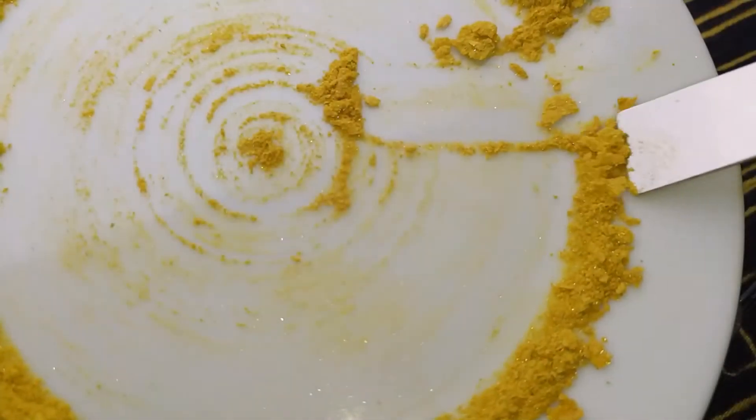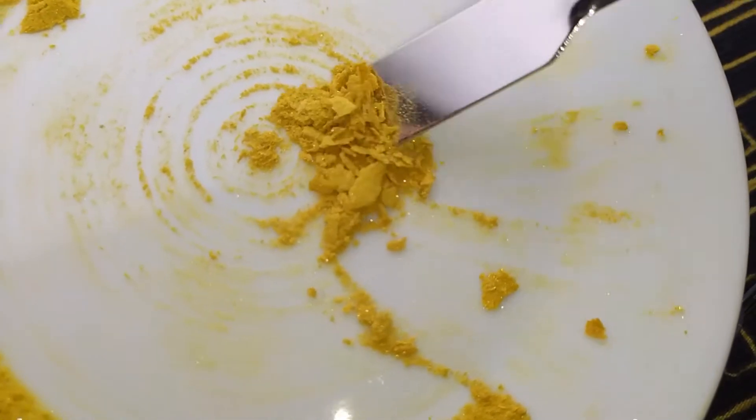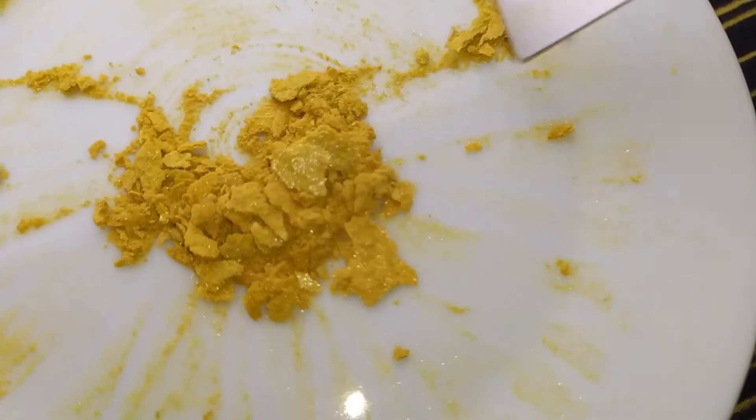Hello everyone. In today's video I want to show you how we can do recrystallization of harmaline alkaloids. Please be advised that this video is strictly for educational purposes and harm reduction, and not an instruction to actions.